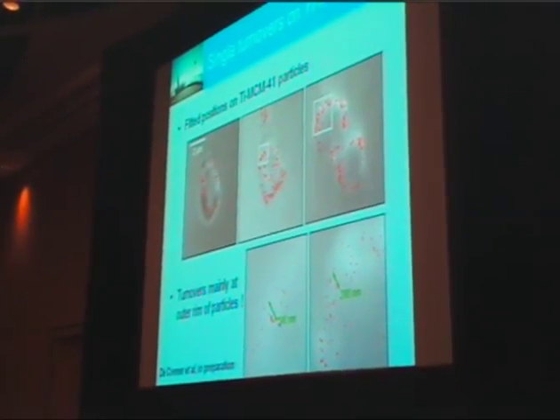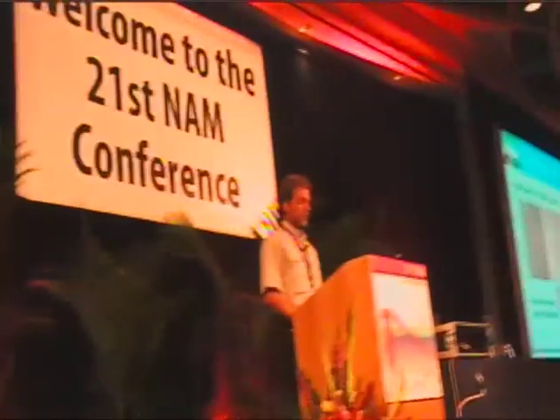Now, if you would zoom in on these regions, we can measure the distance over which turnovers are taking place, and this is typically a few hundred nanometers. So this means that only the outer titanium sites are efficiently used in the catalysis. And this really confirms the hypothesis that intraporous diffusion limitations are the limiting factor here in the catalysis. So before the probe can reach the inner part of the particle, it is already converted by the active sites.